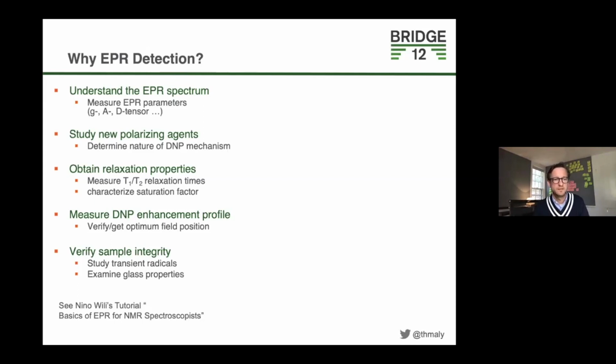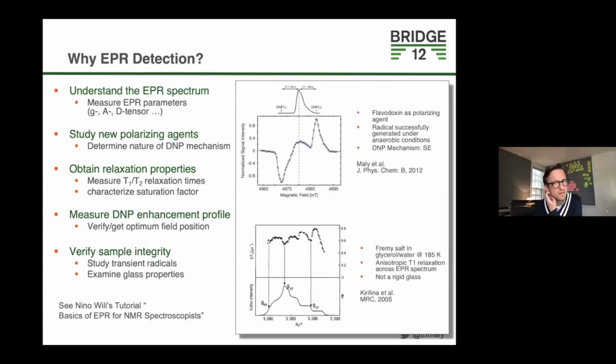There's a great tutorial, I think from a few weeks ago, by Nino Willi about the basics of EPR for NMR spectroscopists. So if you want to learn more about this, look at that tutorial. It gives you a great introduction into EPR spectroscopy. So I'll show quickly two examples here.